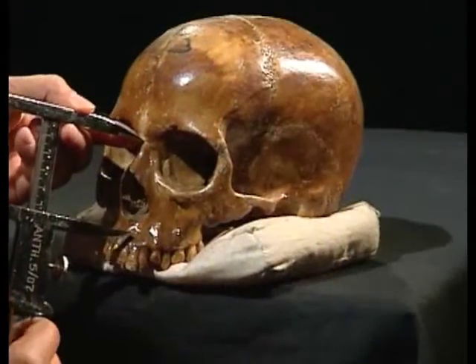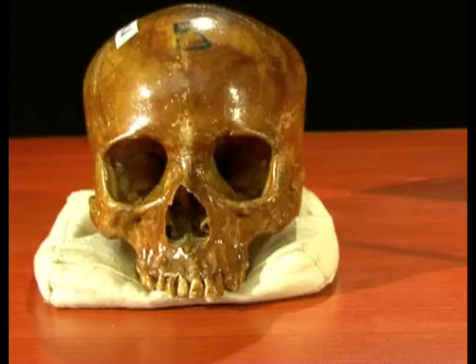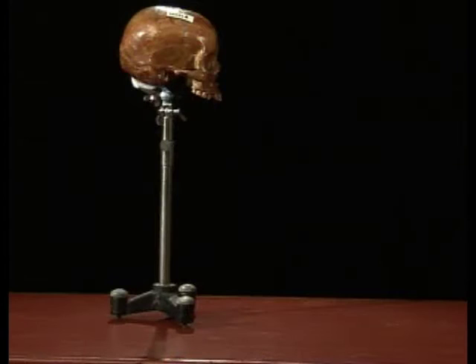Some measurements are taken directly on the skull, which is commonly known as direct measurements, while others are measured on tracing the skull, which is commonly known as indirect measurements. Direct measurements are taken by placing the skull on a pad or by mounting it on a craniophore. In case of indirect measurements, tracing is done with the help of a set of instruments designed for the purpose.